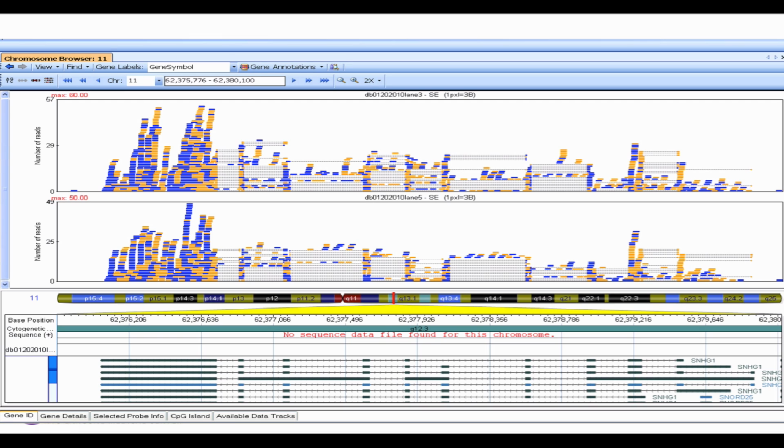on the reverse strand. There's a relatively equal mix of forward and reverse because this sample was generated with a non-strand-specific protocol, so the strands were randomized when the adapters were ligated on. So it's not really that the RNA comes randomly from both strands of the genome. It's just that the reads themselves have been randomized as to which direction we clone them.